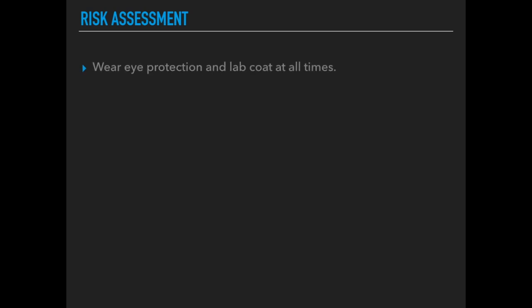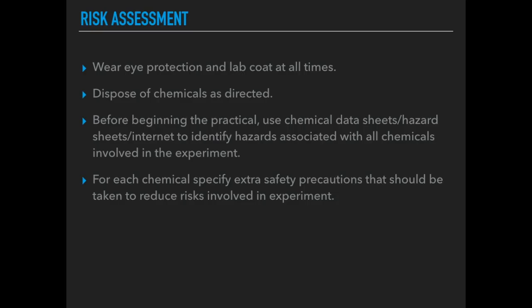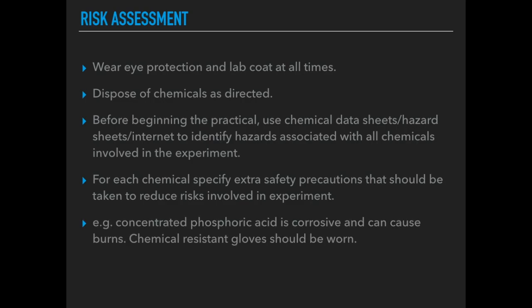Starting with the risk assessment — you shouldn't do an experiment before considering the risks. Obvious things include: wear eye protection and lab coat at all times, and dispose of chemicals as directed. Before beginning the practical, refer to chemical data sheets, hazard sheets, or the internet to identify hazards associated with all chemicals involved, and specify any extra safety precautions for each. For example, concentrated phosphoric acid is corrosive and can cause burns, so an extra precaution would be to wear chemical resistant gloves.